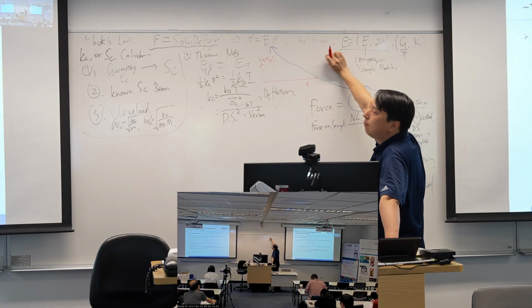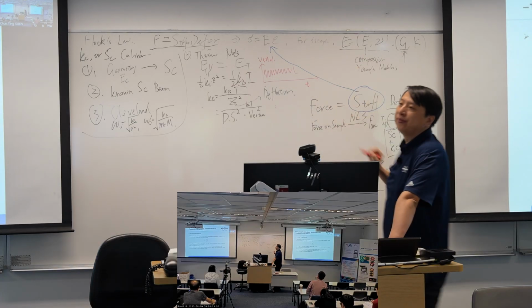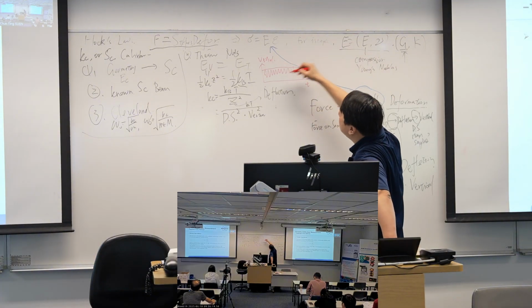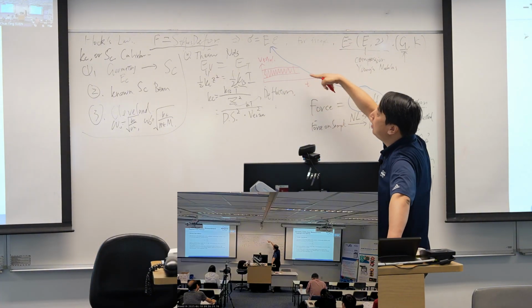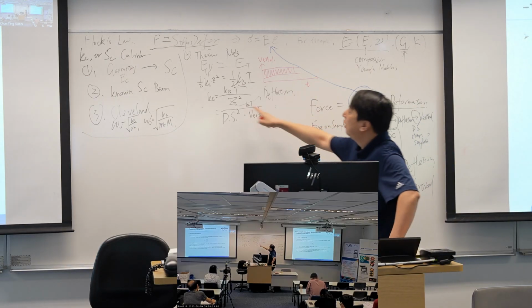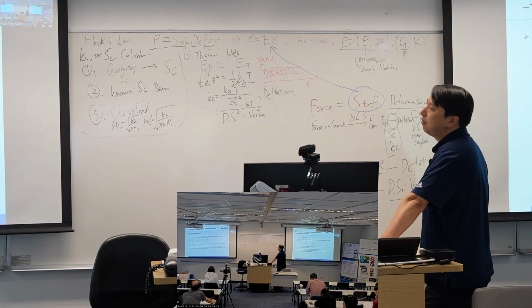We monitor the vertical change against time and observe this kind of curve. From this curve, we calculate its amplitude, and then we can get the vertical out.